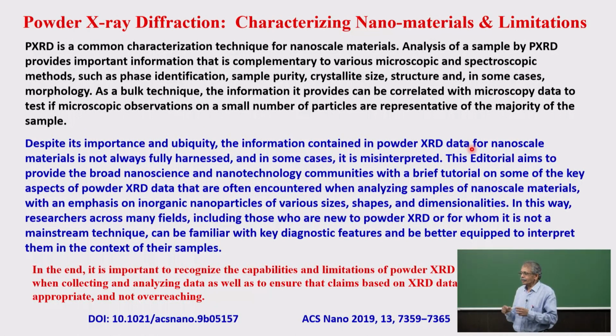Or when you are looking at the size of the crystal, whether it is the same as what you got from the TEM. One can check by transmission electron microscopy the size of the particles, and to some extent even the shape of the particles, etc. You can use that information to fit with this and try to see the explanations that can be made.